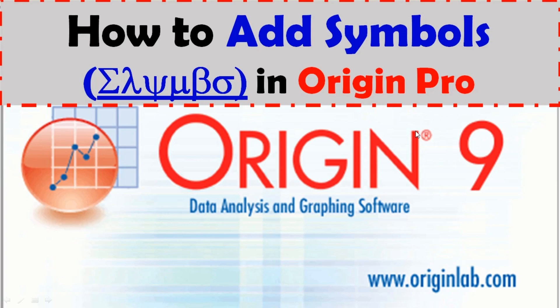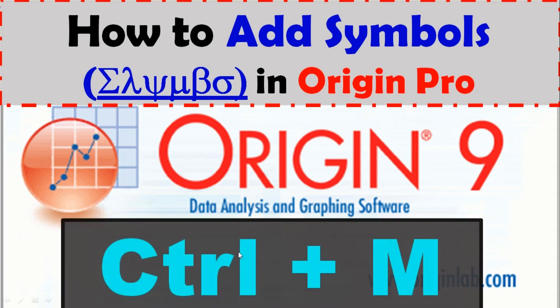This video is about how to use symbols in Origin. These are the symbols we sometimes need to put in graphs. There is a shortcut for this, and that is Ctrl+M. Just press Ctrl and click M.